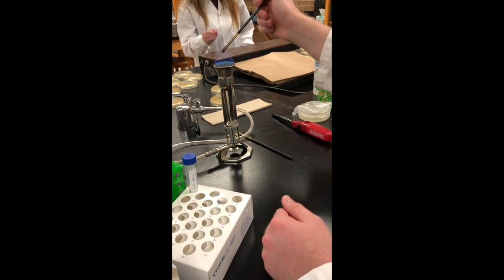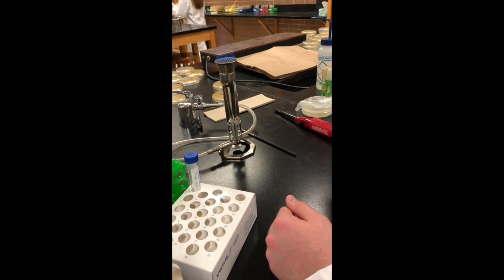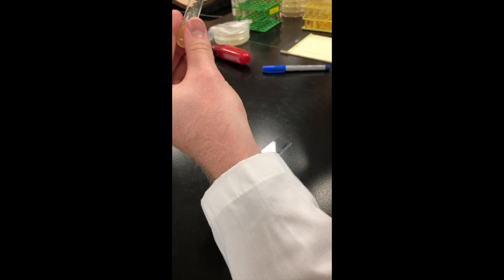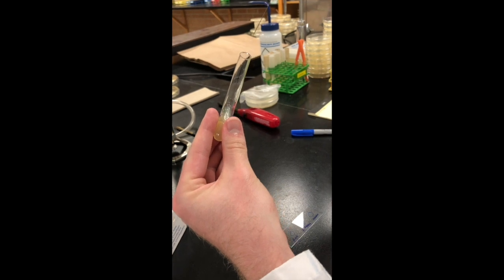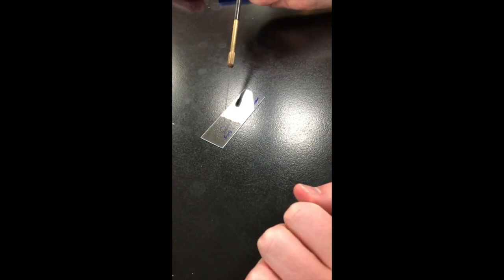Andrew is working on the catalase test. For this test, we look to see if our organism has the enzymes to break down hydrogen peroxide into less harmful forms of oxygen. And so we have a bacterial slide that we have made circles on, and all we're going to do is we're going to grab some of our bacteria, and then we're going to put that directly on the slide within our circle.